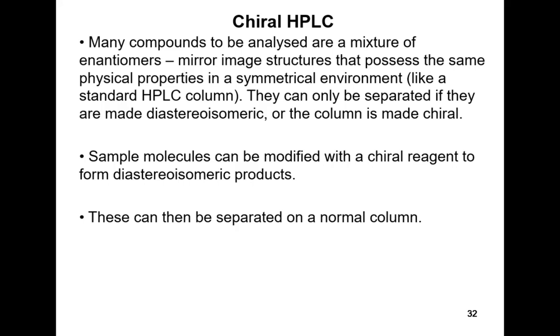However, in certain circumstances, you can't tell the difference between them. If they're in a symmetrical environment, like just in solution, where all the solvent molecules are moving around freely, you can't tell the difference between those mirror image forms of the molecules. And that's what you would have in a standard bonded phase HPLC column.